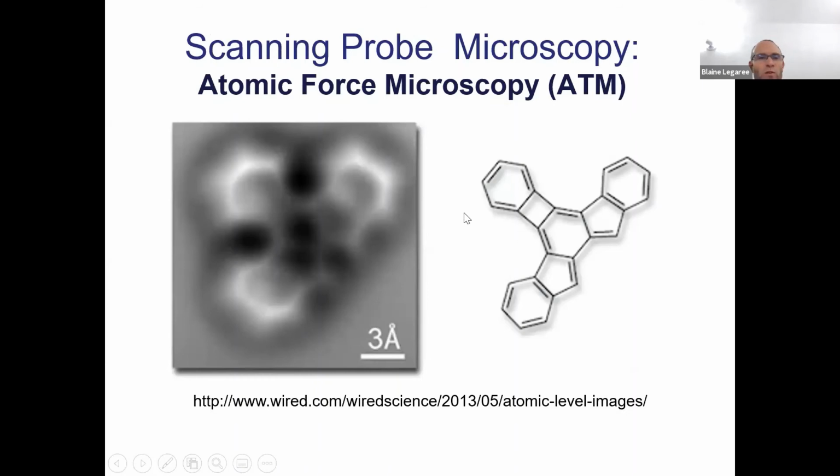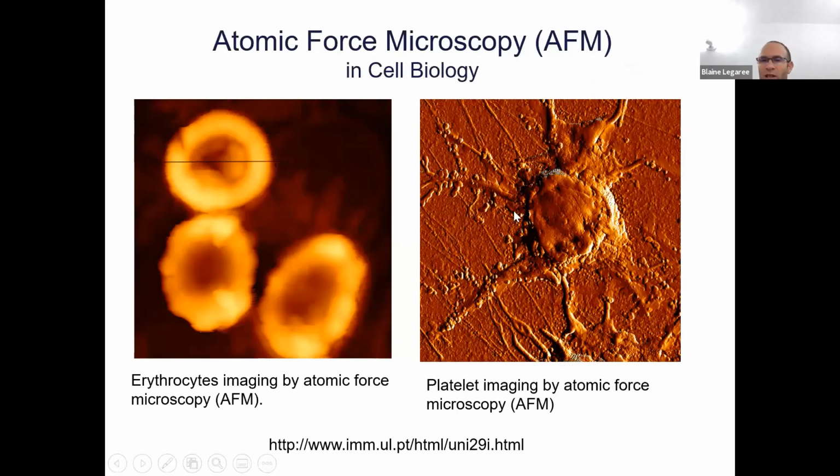Here's one more picture I thought I would show you. It's a little bit more difficult when you get to biological specimens. Biological specimens, as you probably know, are usually not hard, they're kind of squishy. And again, think of the blind man: if you're touching something squishy, just by touching it, it's going to get mooshed around. Like Play-Doh, things will get bent. If you're touching a flower, the leaves and the petals will bend over. So sometimes it's a little harder biologically to get good images. We can't quite get down to atoms when we're looking at biological specimens, but we can get some interesting details.